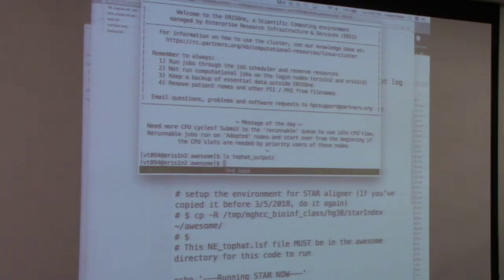Oh, no. Wait, can you go back? So slash fastq files, the F and the second F in capitals, okay, and space dot. What's the error? The lowercase uppercase? No, it just didn't have the fastq files in its folder.